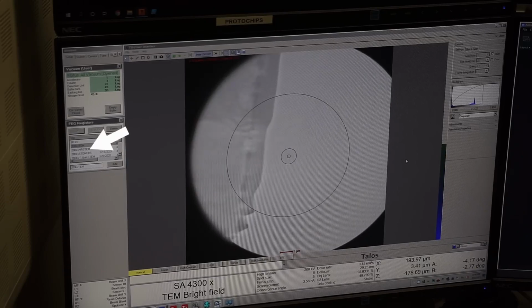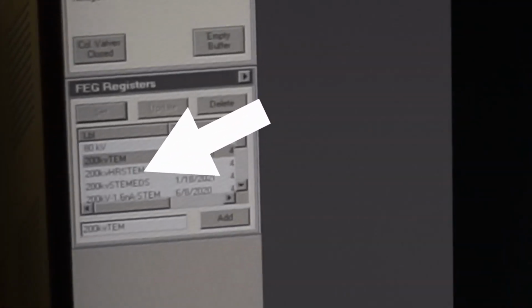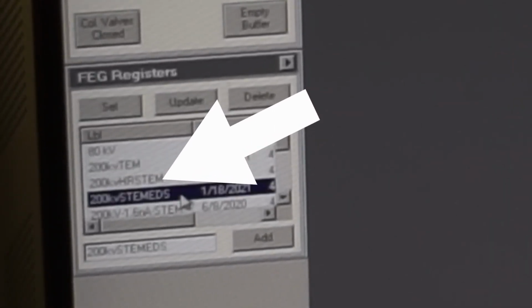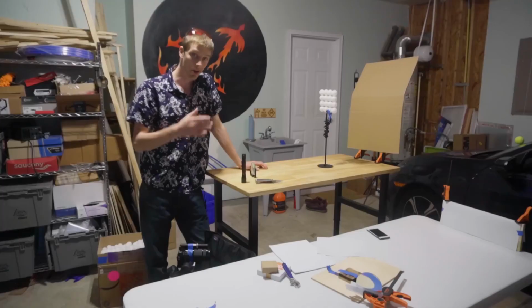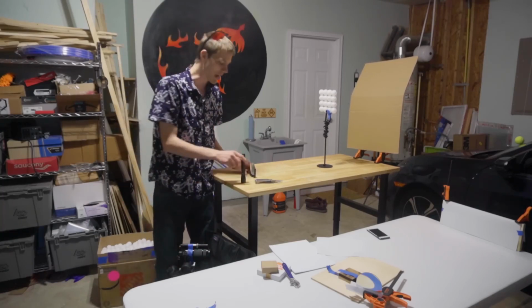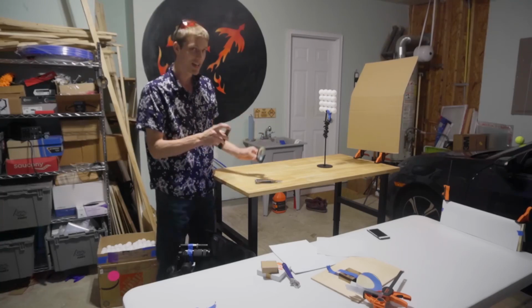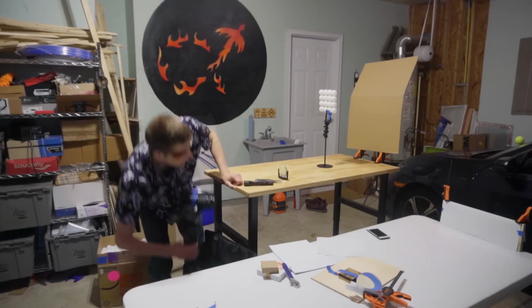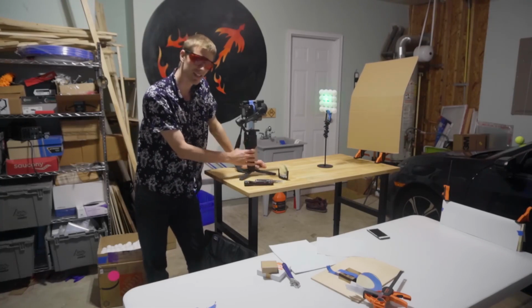So as soon as I push this button right here marked STEM, the microscope is going to switch modes, and all of my explanation so far, and a lot of this talk of projected shadows, is going to have to change. Alright, so now we've switched modes. Where TEM was pretty well represented by a flashlight and some lenses to create big parallel beams, STEM is probably best represented by a laser mounted on a gimbal. And that is to say, it's a lot more fun.